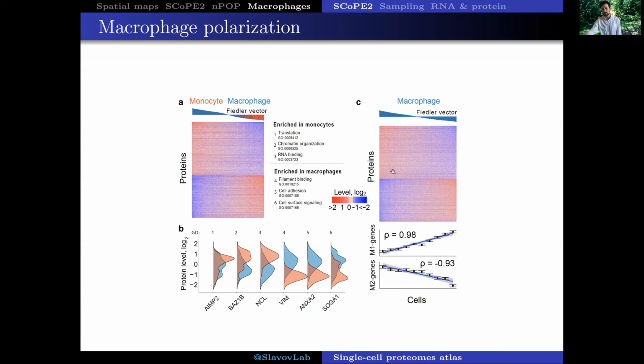So we looked at the functions of the proteins that are more abundant on the left or on the right of this cluster. And we found, as indicated below this panel here on the bottom, that there is almost perfect correlation to the abundance of genes that were previously identified as being M1 or inflammation polarization specific markers, or M2 for alternatively activated or anti-inflammatory macrophages, suggesting that this propensity of macrophages to differentiate into pro and anti-inflammatory cells is inherent to them.